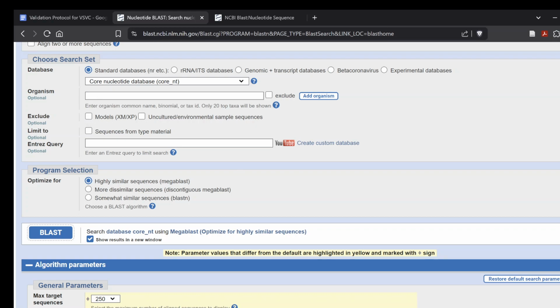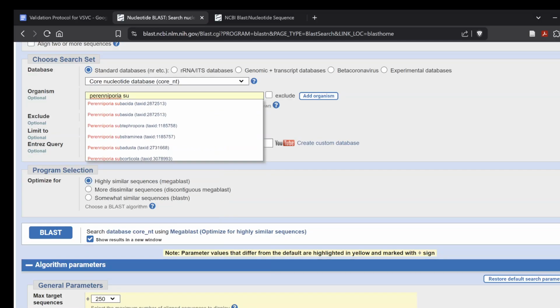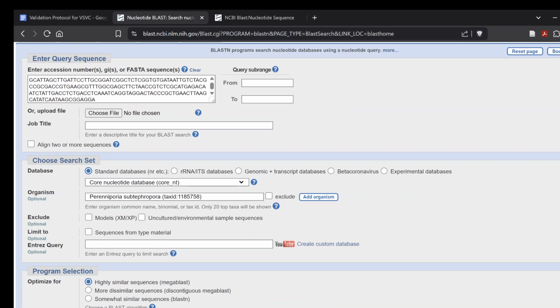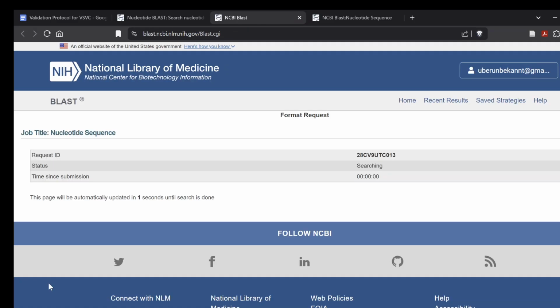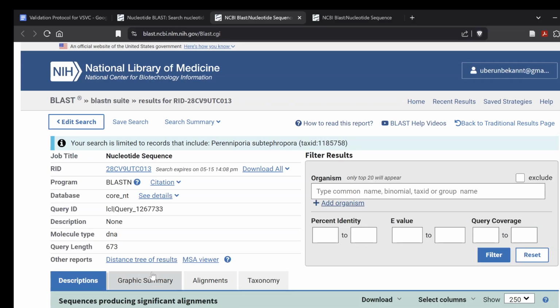We can actually go and choose that. So now I'm going to compare this sequence against only sequences with that ID. And that way, if there's stuff that's not showing up in the BLAST search because it's so far away, but it's using a similar name, you can find that.